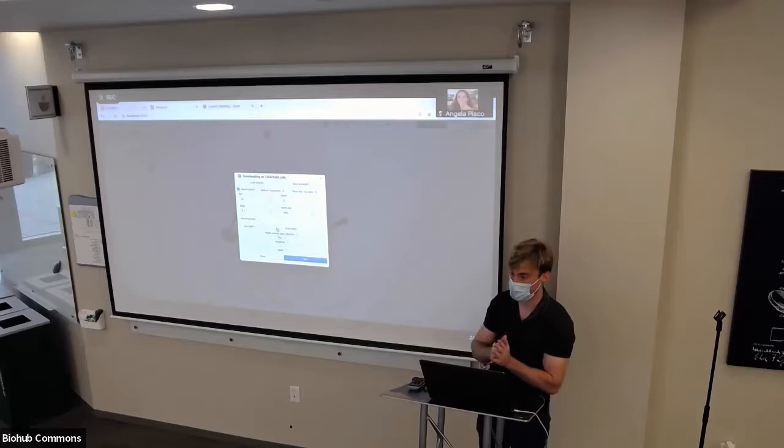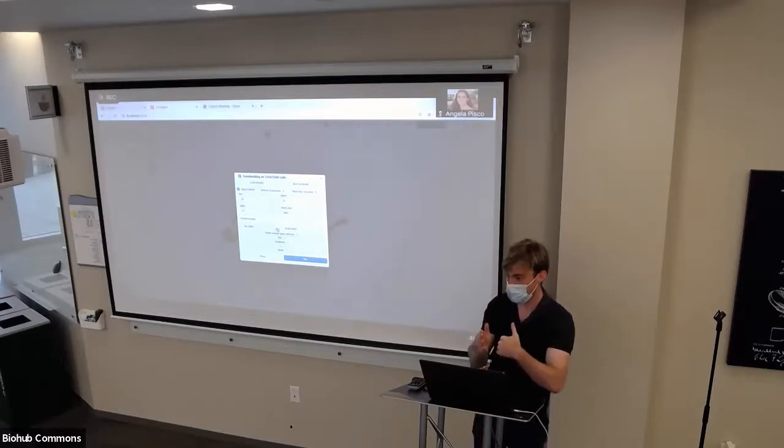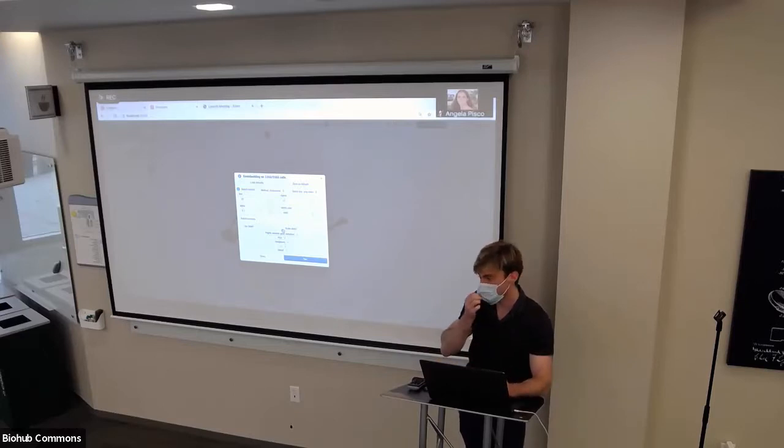Housekeeping genes can have anywhere from like 1 to like 100 expression, and this variability actually gets captured by PCA. If you standardize it and it has high mean expression and also high variation, then it compresses it down to a smaller distribution that isn't so intoxicating for PCA. So that's what scale data is doing, but it works best on data sets with a lot of cell types. If you have data sets with, let's say, only 2 or 3 cell types, this can actually do more harm than good because it's lowering the signal strength of marker genes.